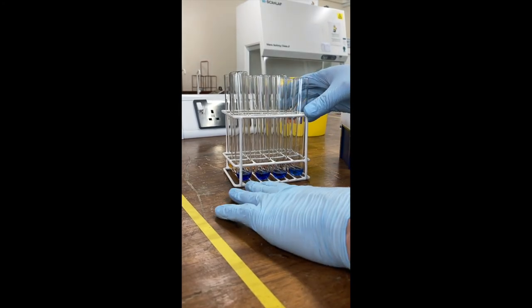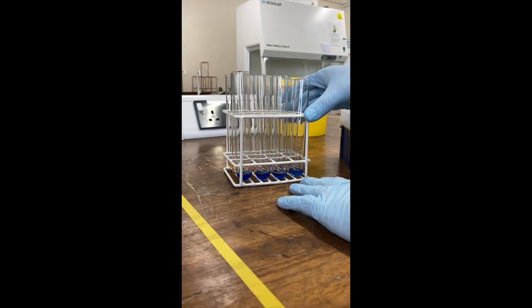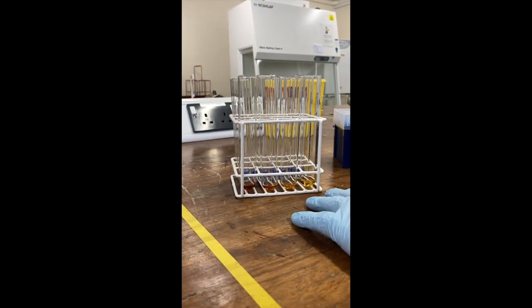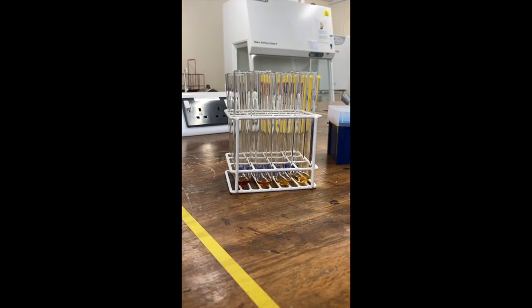So there's the two methods. You can either do dilutions where you know the volumes or you have known volumes, which you dilute one to one, and then you work out the concentrations from that.